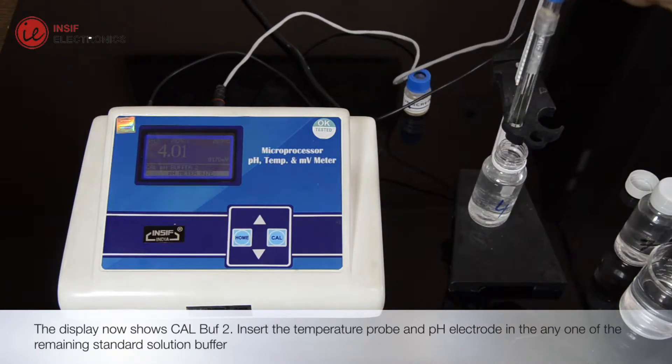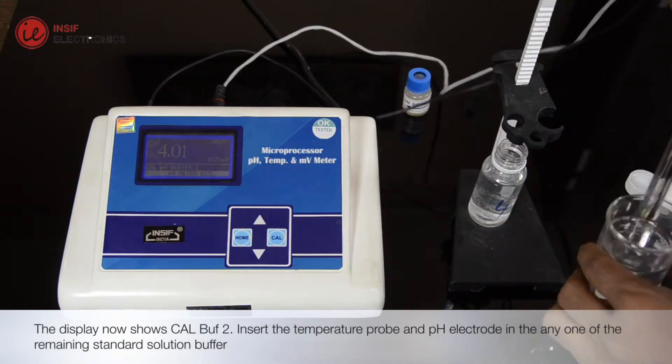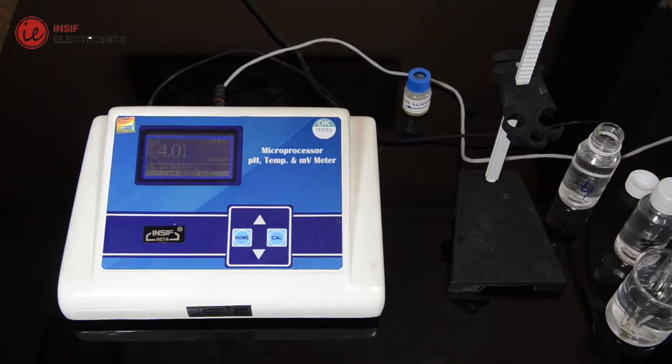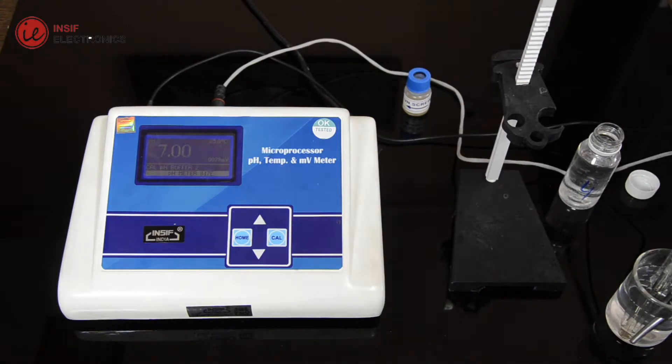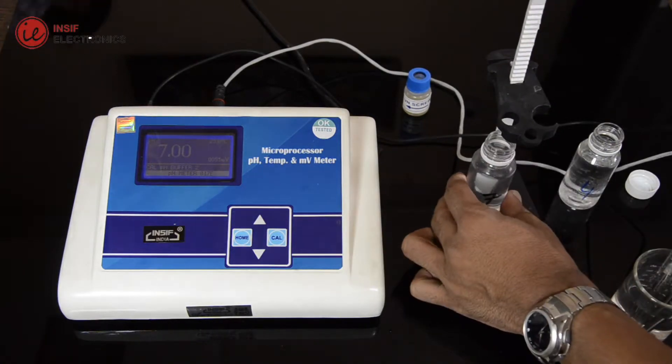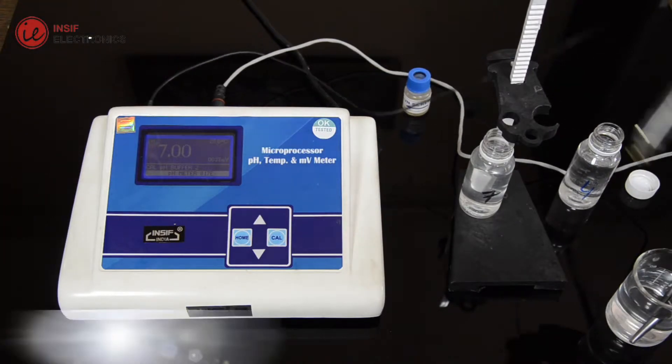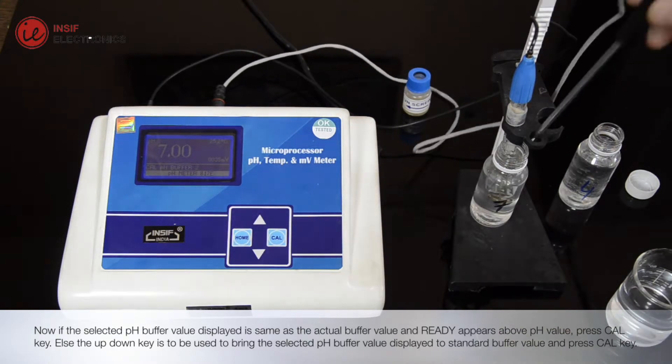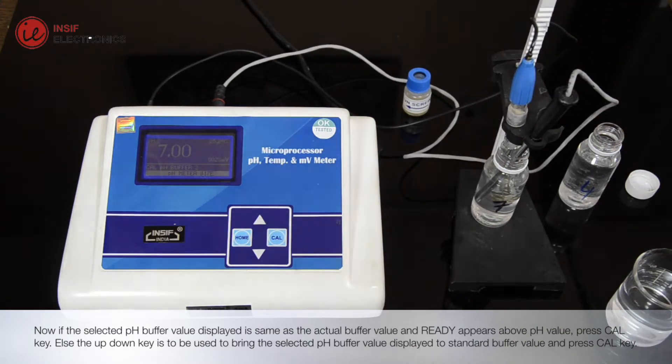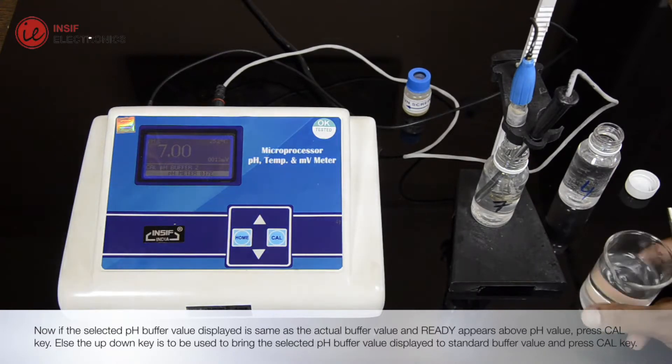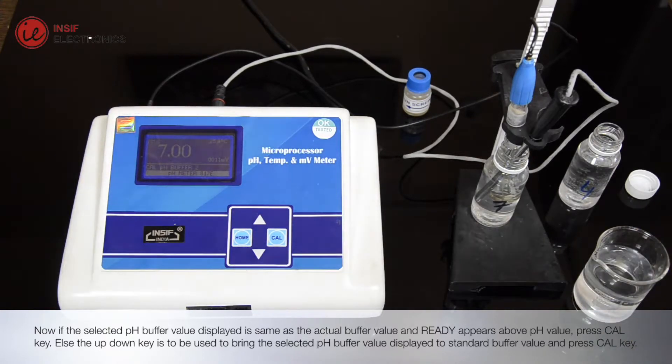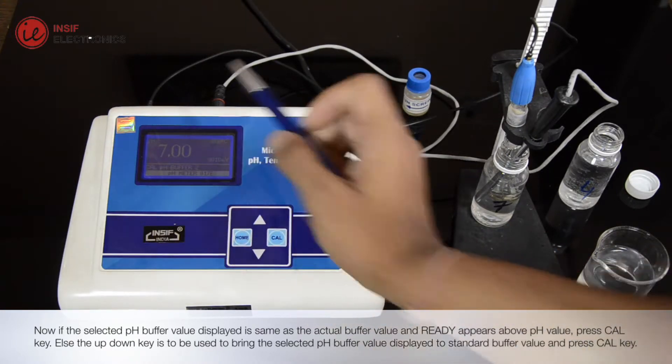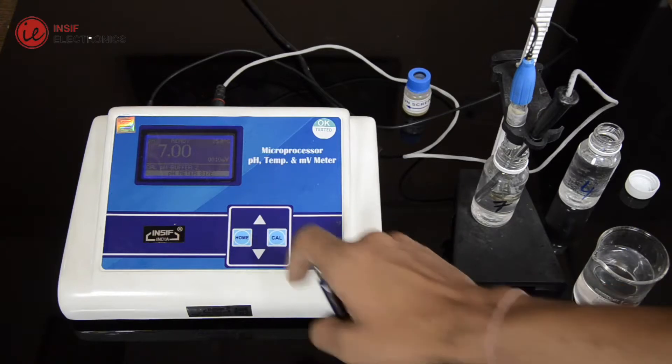Insert the temperature probe and pH electrode in the NE1 of the remaining standard solution buffer. If the selected pH buffer value displayed is same as the actual buffer value, and ready appears above pH value, press Cal key. Else the up-down key is to be used to bring the selected pH buffer value displayed to standard buffer value, and press Cal key.